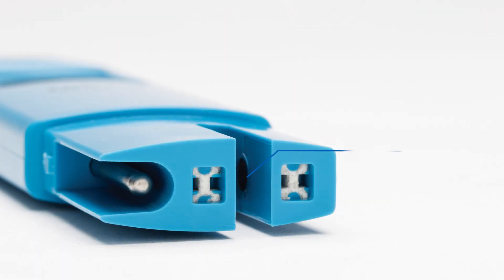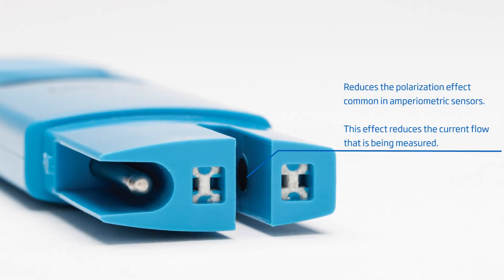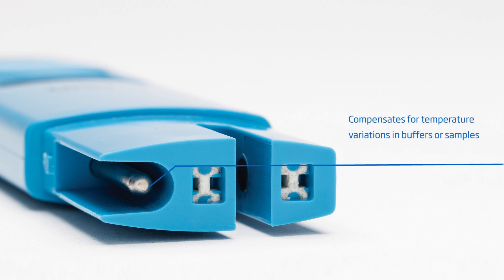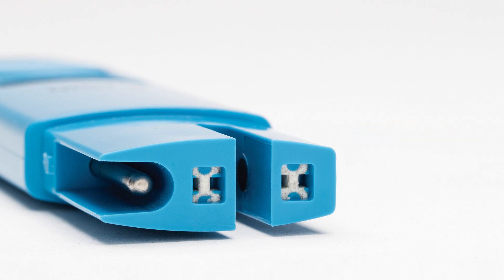The DIST family utilizes an amperometric graphite electrode to measure both conductivity and TDS. The exposed temperature probe of the DIST provides for a rapid temperature measurement in order to compensate for any temperature variations in the calibration buffers or samples being measured. This is absolutely necessary to achieve a high-accuracy reading, as conductivity and TDS measurements are highly influenced by temperature.